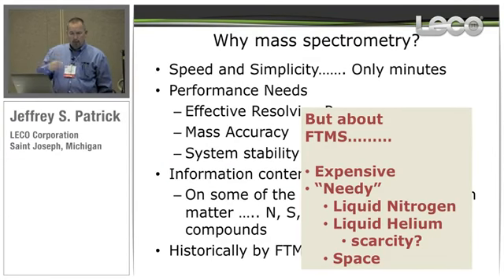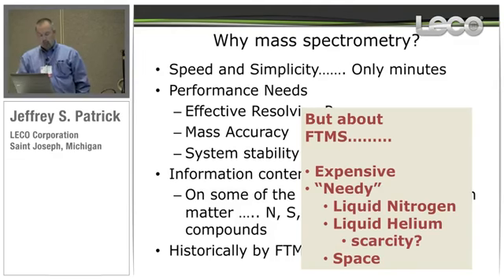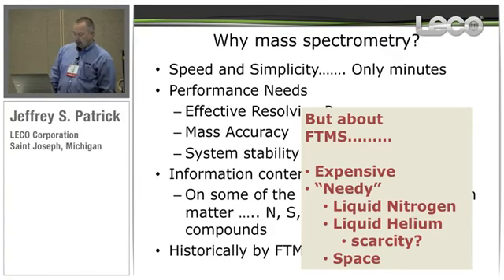So why mess with FTMS if it's been around for so long and has been successful? Well, it's expensive, approaching $1 million, and it's needy. You have to feed it liquid nitrogen and liquid helium, and it occupies a lot of space.